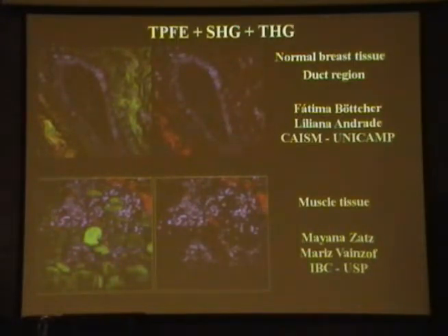But you can understand. And that's the position where the usual breast cancer starts to grow. And so if you want to see a nice interface here, covered with two layers of cells, two nucleus, then you know that everything is okay.